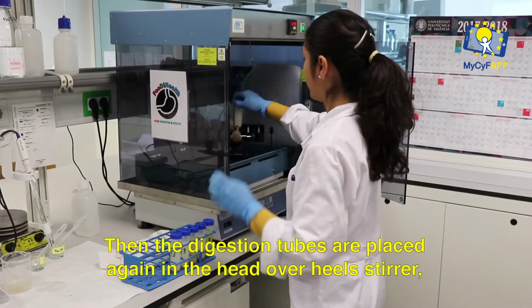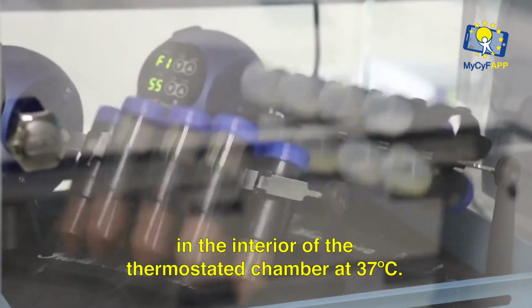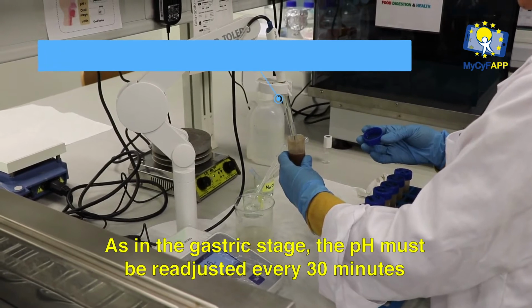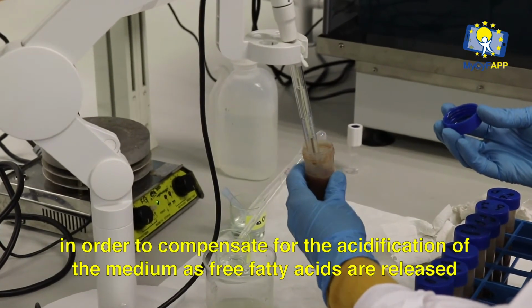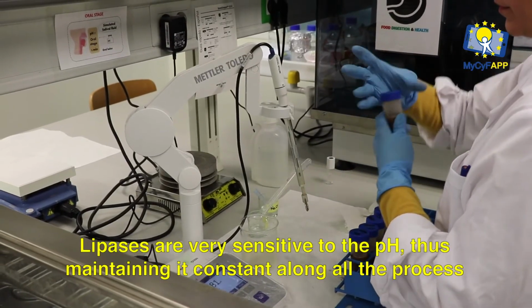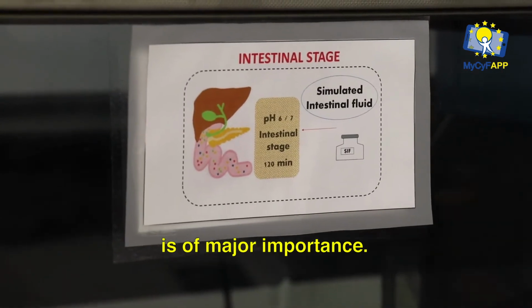Then, the digestion tubes are placed again in the head-over-heels stirrer in the interior of the thermostated chamber at 37 degrees. As in the gastric stage, the pH must be readjusted every 30 minutes in order to compensate for the acidification of the medium, as free fatty acids are released as the product of lipolysis. Lipases are very sensitive to the pH, thus maintaining it constant along all the process is of major importance.